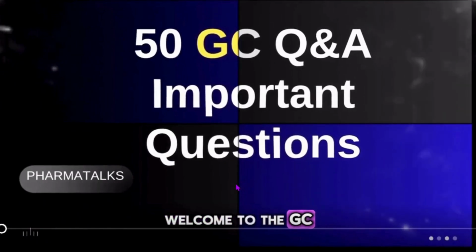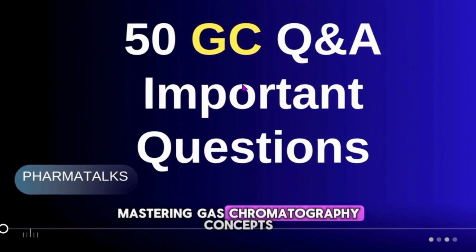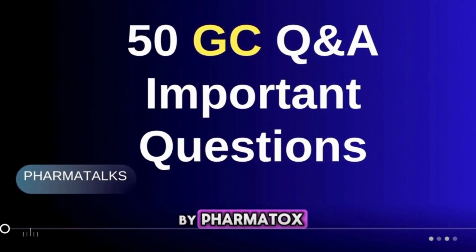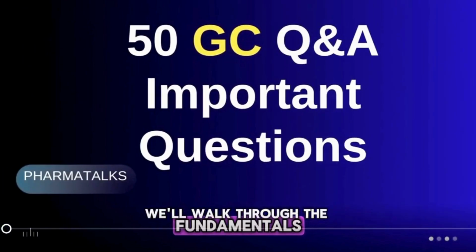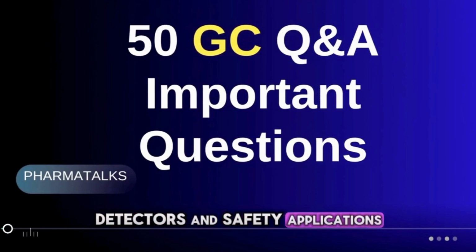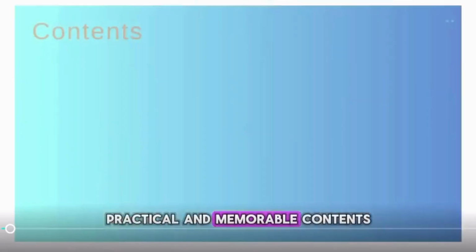Welcome to the GC Most Important Q&A, your complete guide to mastering gas chromatography concepts. This presentation is designed by Pharma, where science meets clarity. We'll walk through the fundamentals, instrumentation, columns, detectors, and safety applications. So, grab your notebook. We're about to make GC simple, practical, and memorable.